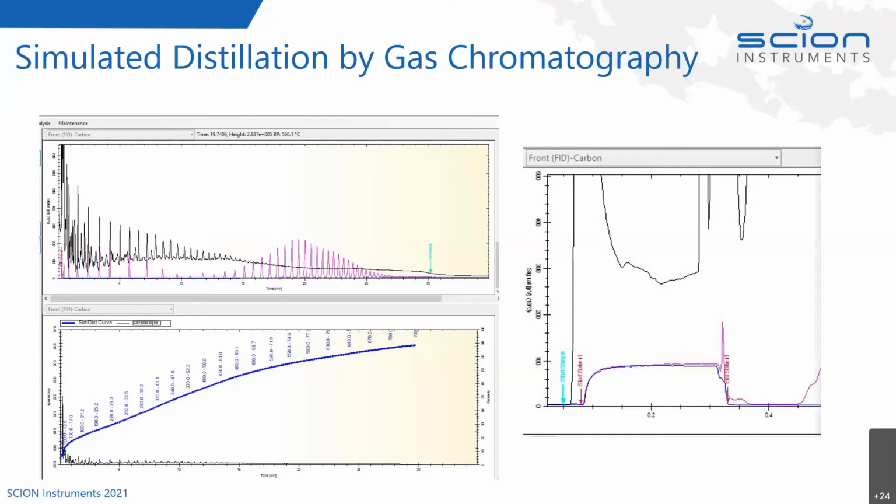Now, the issue we're going to have with this analysis, especially at the really lower boiling point ranges, is the influence of the carbon disulfide, because it obscures the elution of the really light material in the crude oil sample. There are some quenching factors in the software, but what would be better is for us to run a DHA analysis and add to the very bottom of this curve, which is quite an important area. It's where the naphthas are, so it's really important for us to get this information. It makes it much more accurate when we combine it, as we'll see.